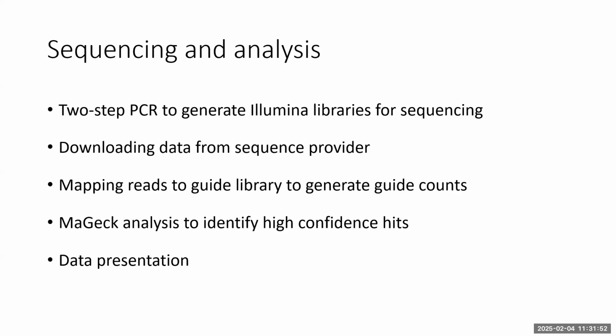Then there's the data presentation. I'm not really going to go into that too much because it tends to be a less specialized thing and just depends on what program you're using, Excel or the newer ones, GraphPad and these kind of things. Or if people are more adept, they can use R to generate various different things. So we'll just go over some of the basic kind of presentation.